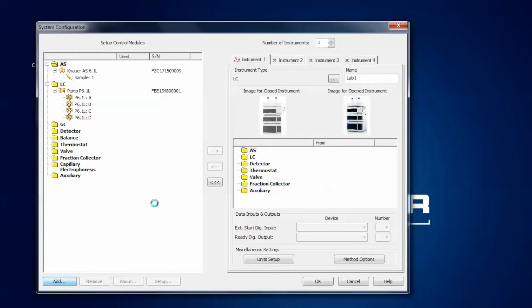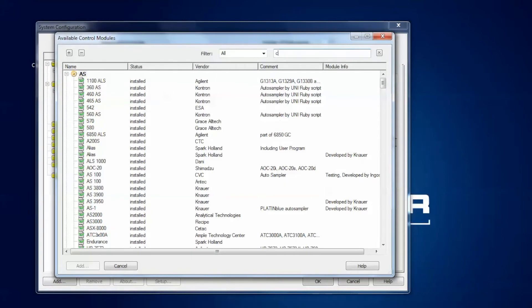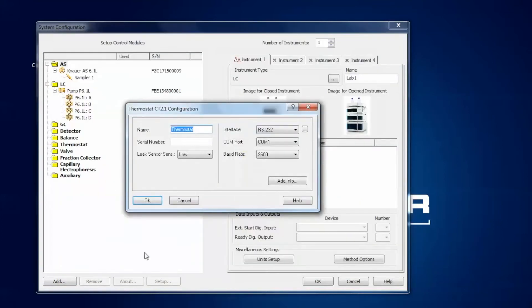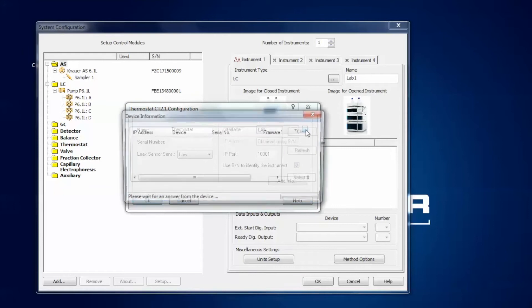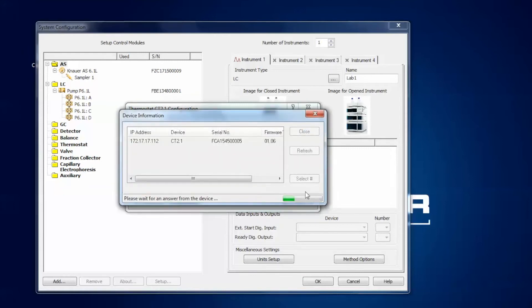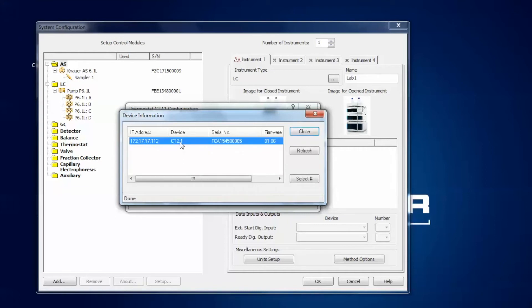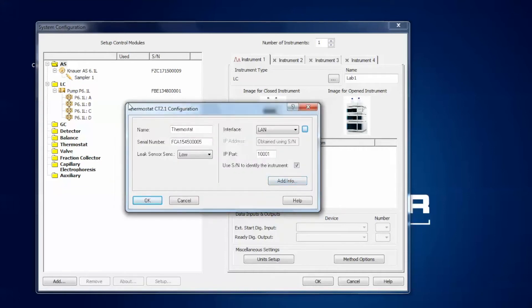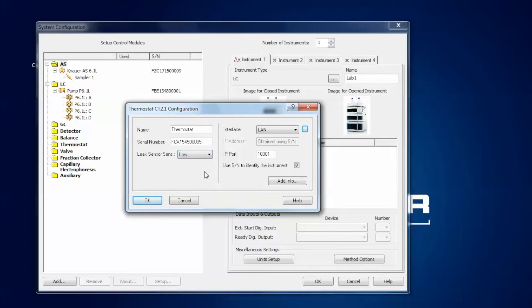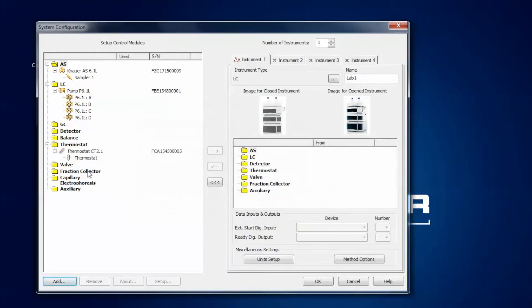Next we will add the column thermostat. Type in the name, select the device, and click add. In the configuration window you can change the name of the thermostat if you like, type in the serial number, and change the connection setting to LAN. The software scans the network — wait until the process is finished, then select the device. The serial number is filled in automatically and you can adjust the leak sensor sensitivity to low, medium or high. I keep it at low and since there are no more options, I click OK. The thermostat is now added to the list.